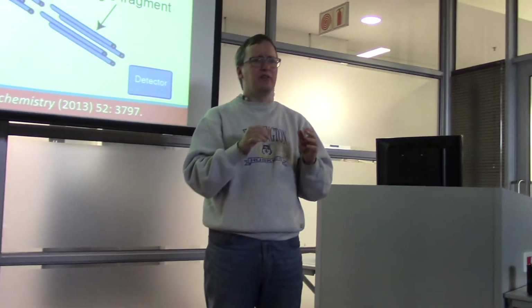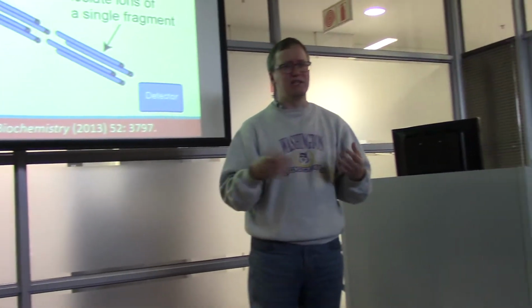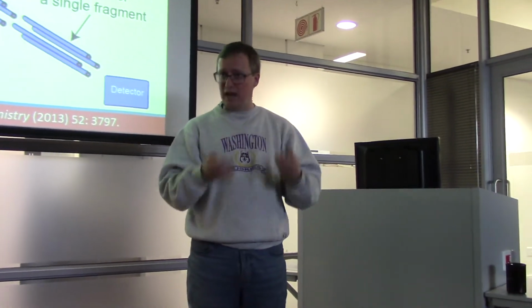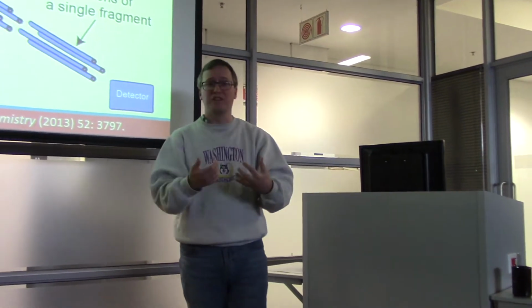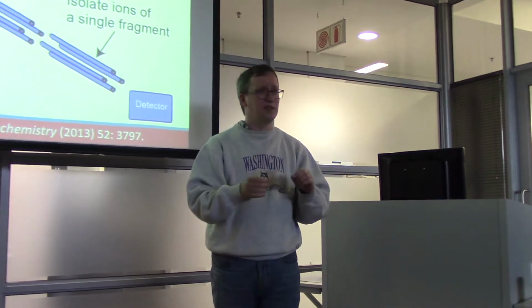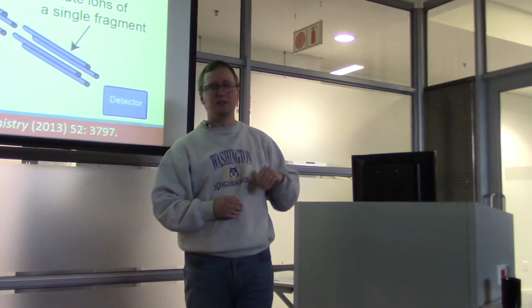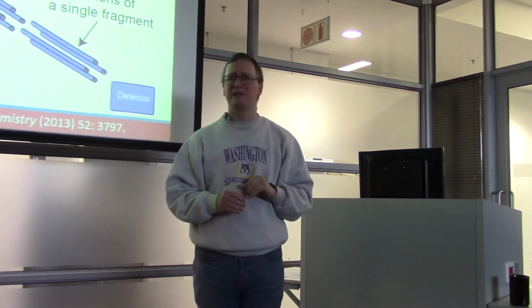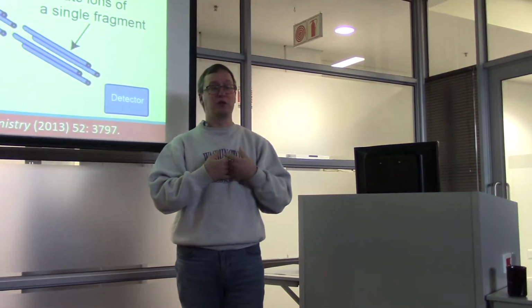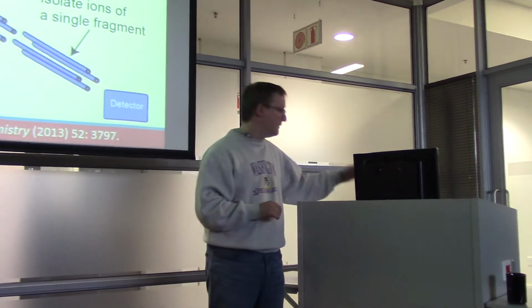Now, why would we bother measuring multiple fragments and multiple peptides for a given protein? We want to have multiple lines of evidence to quantify this particular protein. By having multiple peptides, if we see that 2 of these peptides show a rise by 20%, and 1 of these peptides shows a fall by 60%, we want to know that to give us some estimate of how much assurance we have about this quantitation being valid.